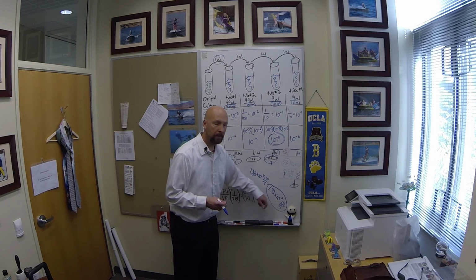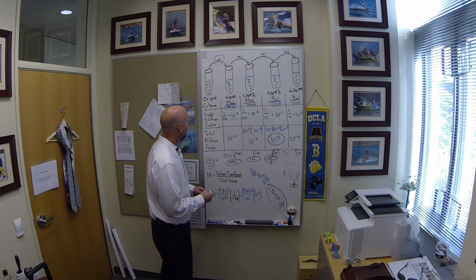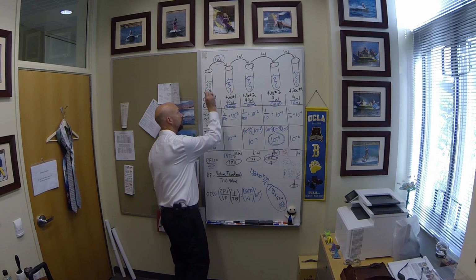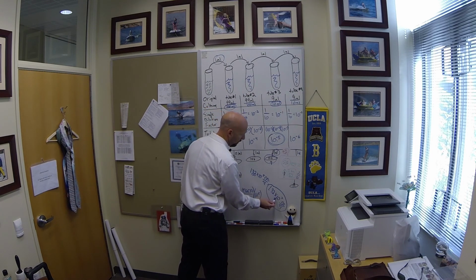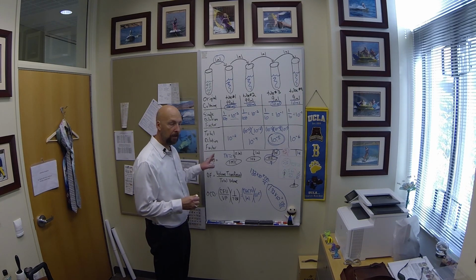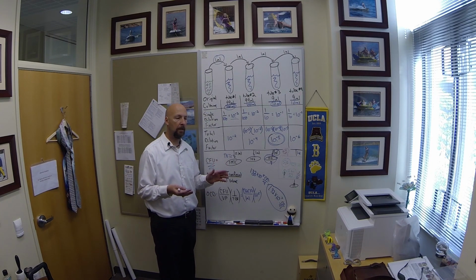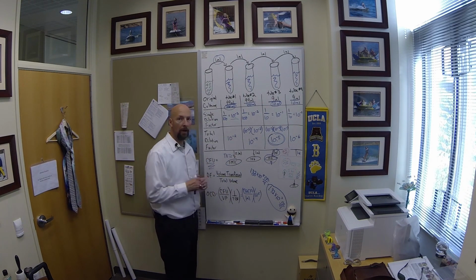What does this number represent? This is the density of the cells in this original culture right here. So the original culture density, this is the original culture, is 1.32 times 10 to the 7th CFUs per mil. I guarantee you that there will probably be a quiz question, or at the very least there will be questions on one if not both of the lab practicals relating to what I just did here.